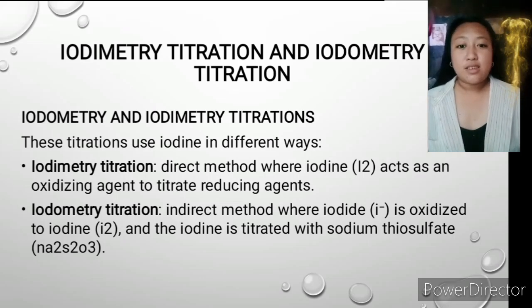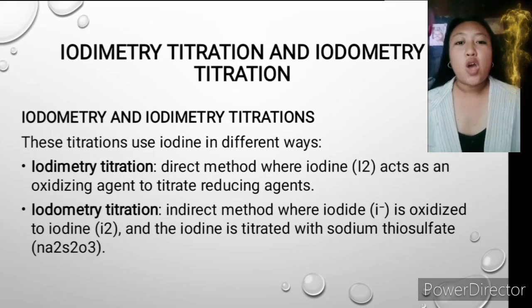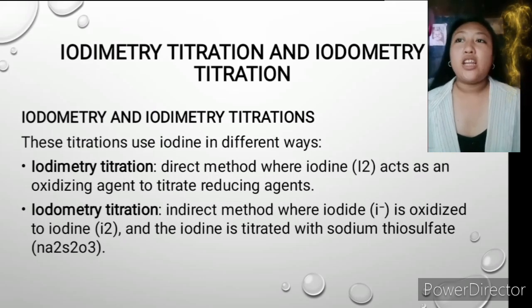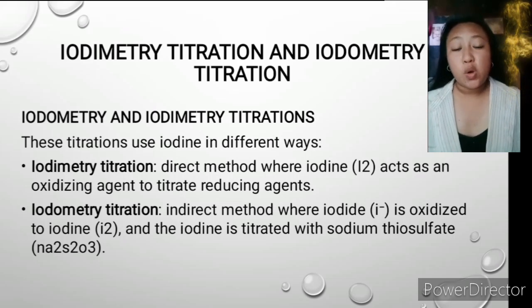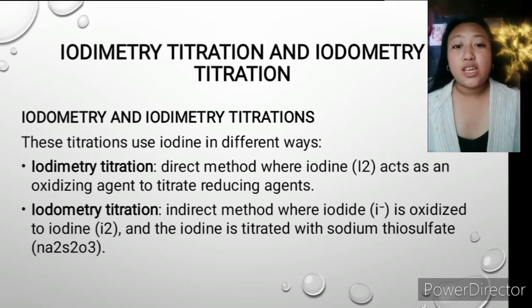It means the titrant we will be using is the iodine solution. We'll be putting it in the burette, and in our conical flask or the Erlenmeyer flask, we'll be putting the sodium thiosulfate, which is our reducing agent.